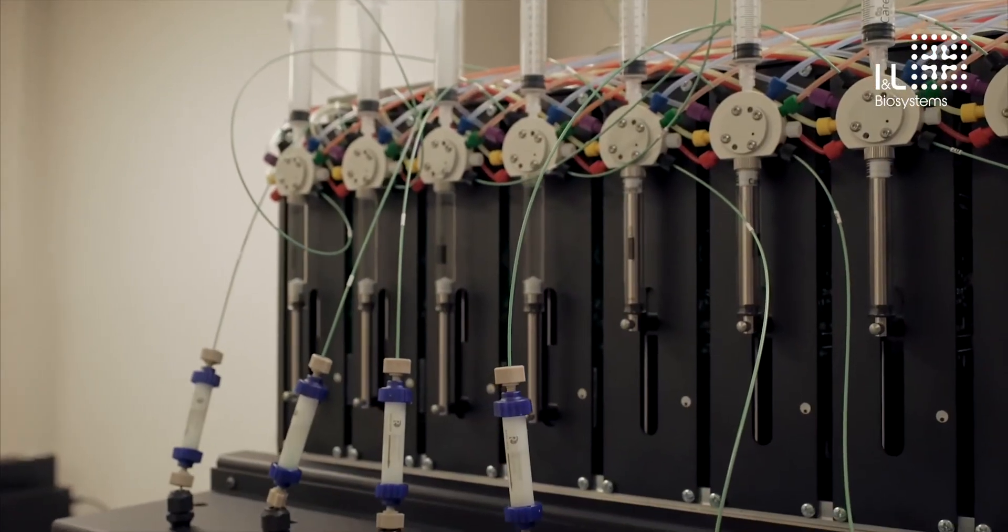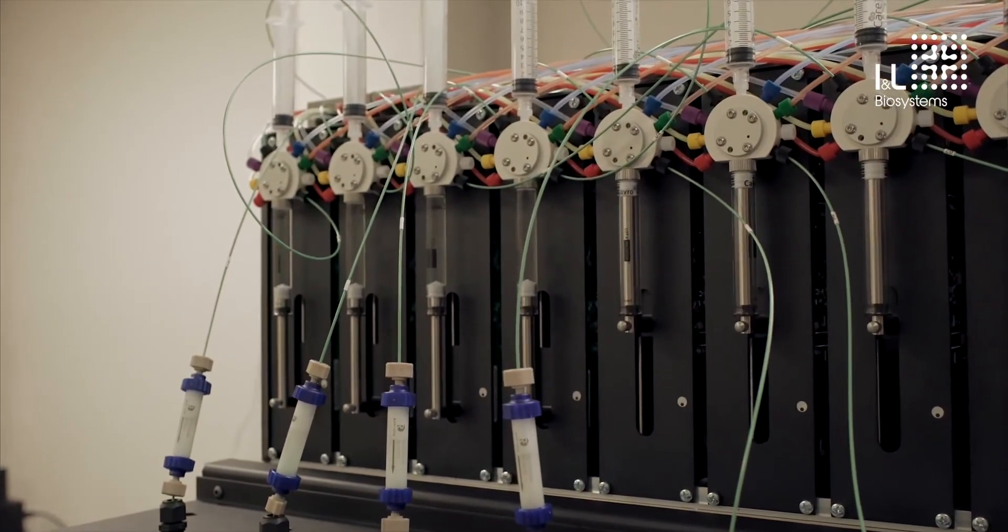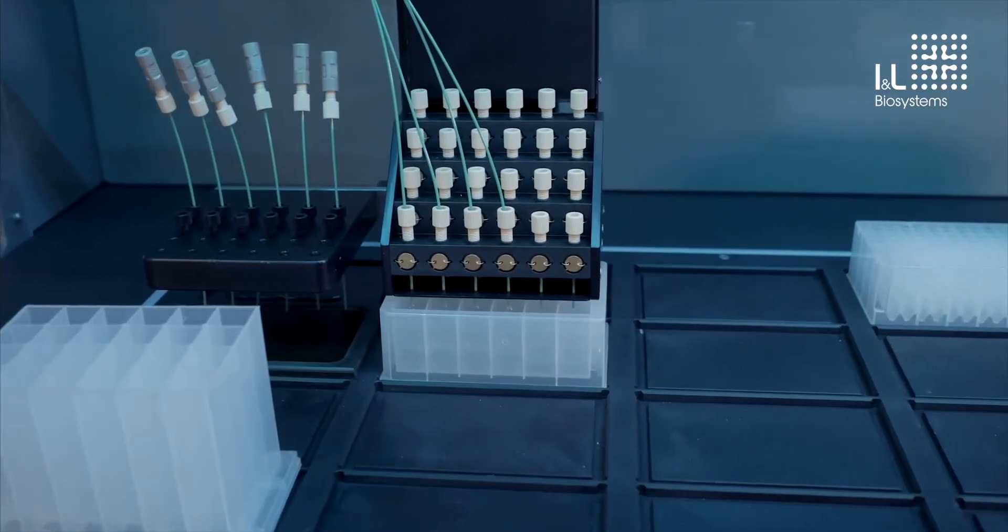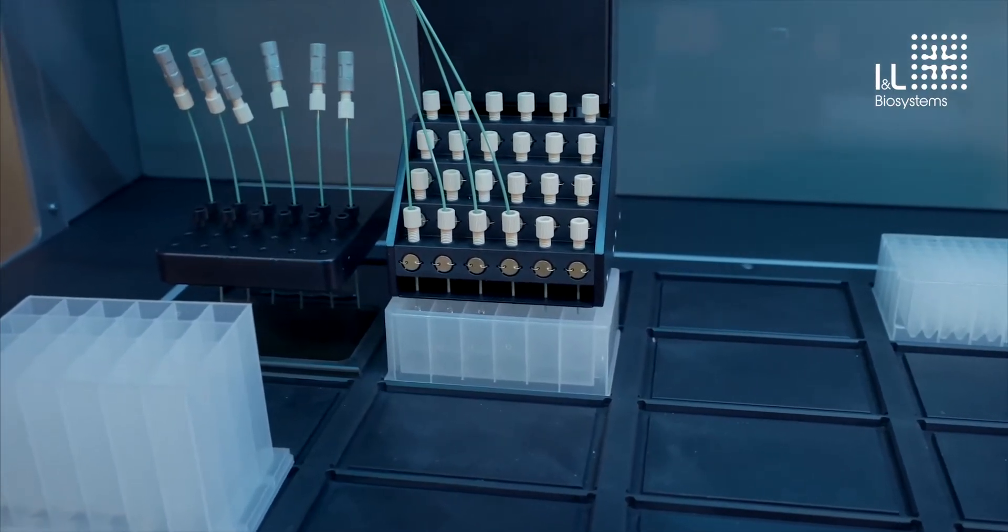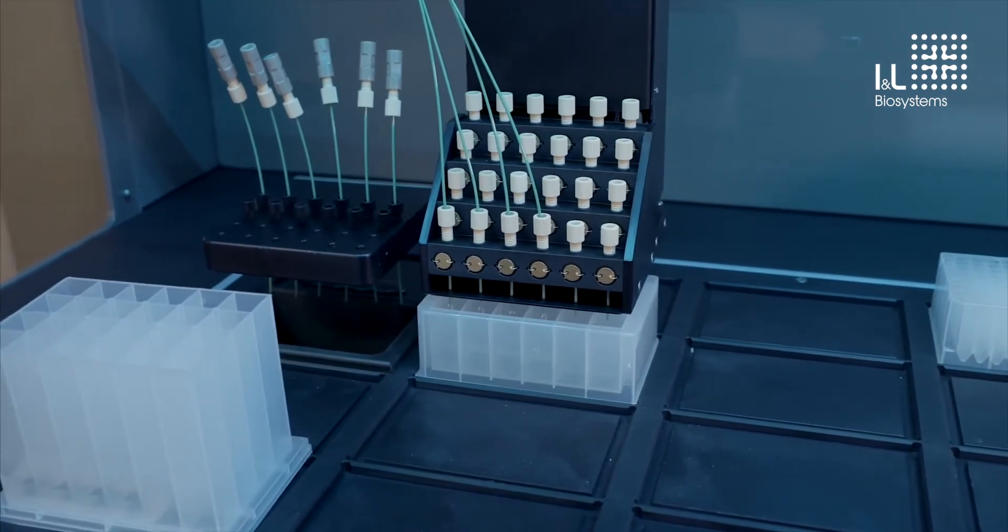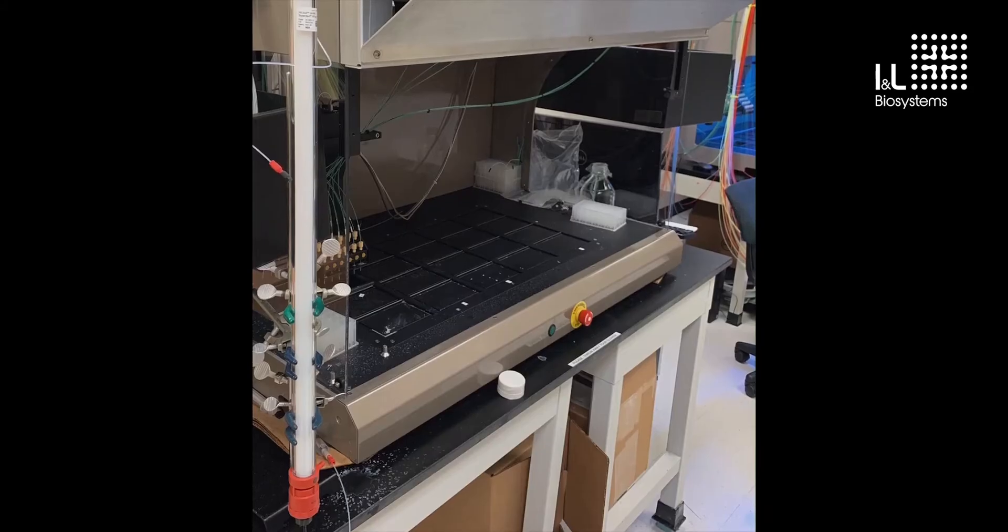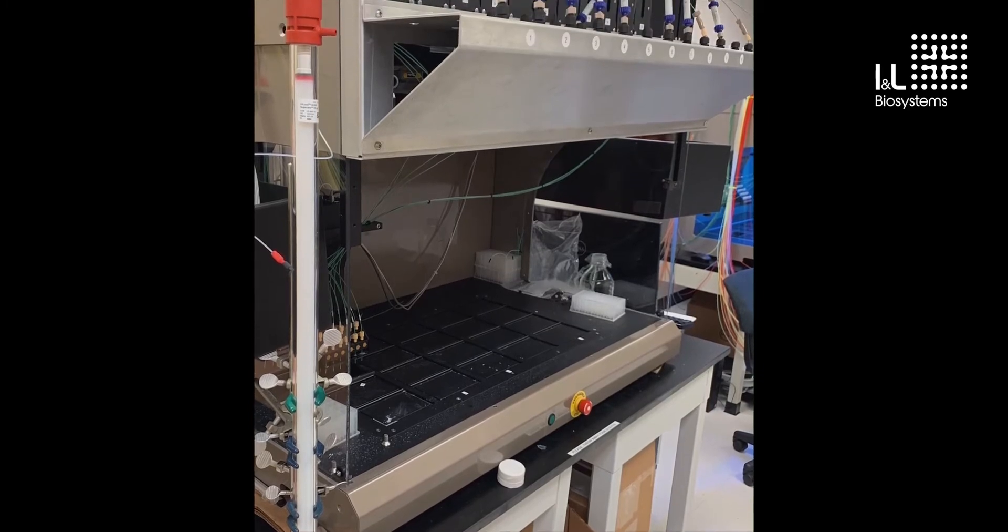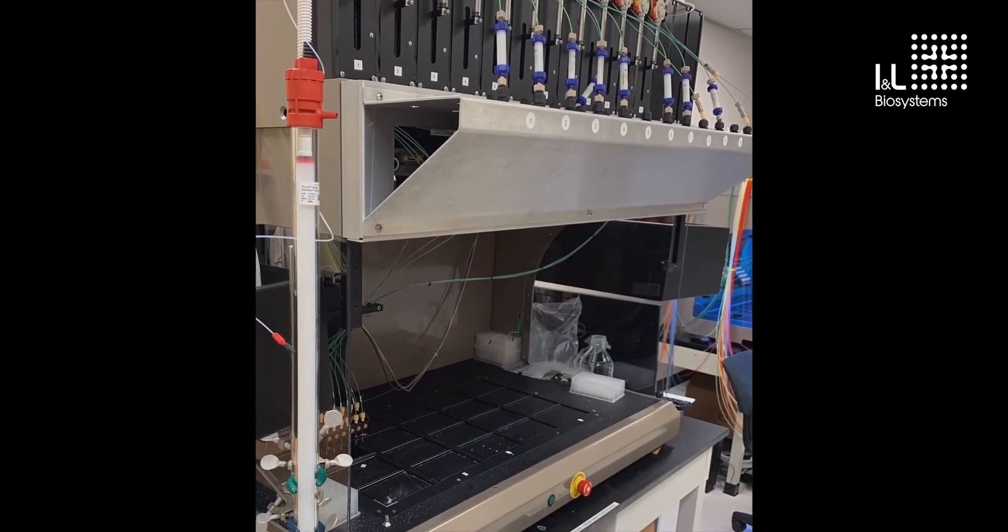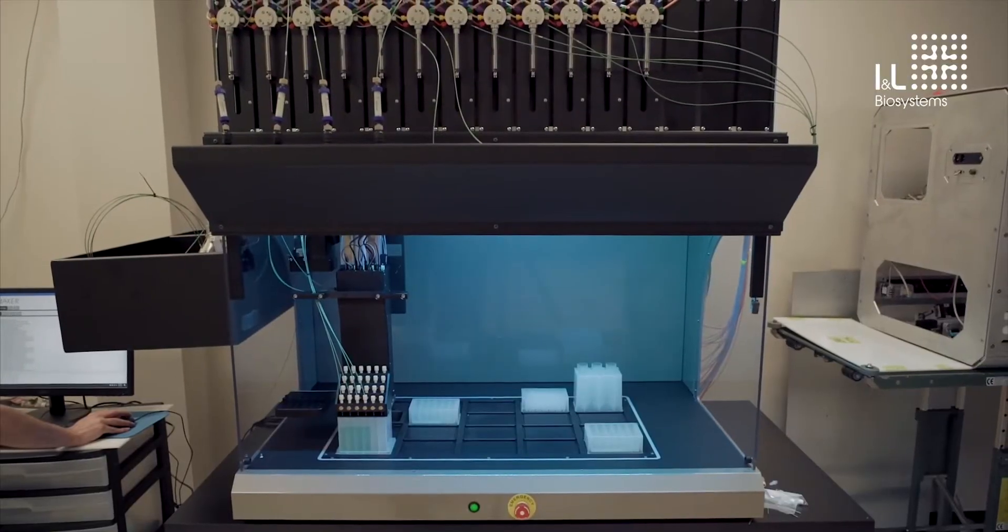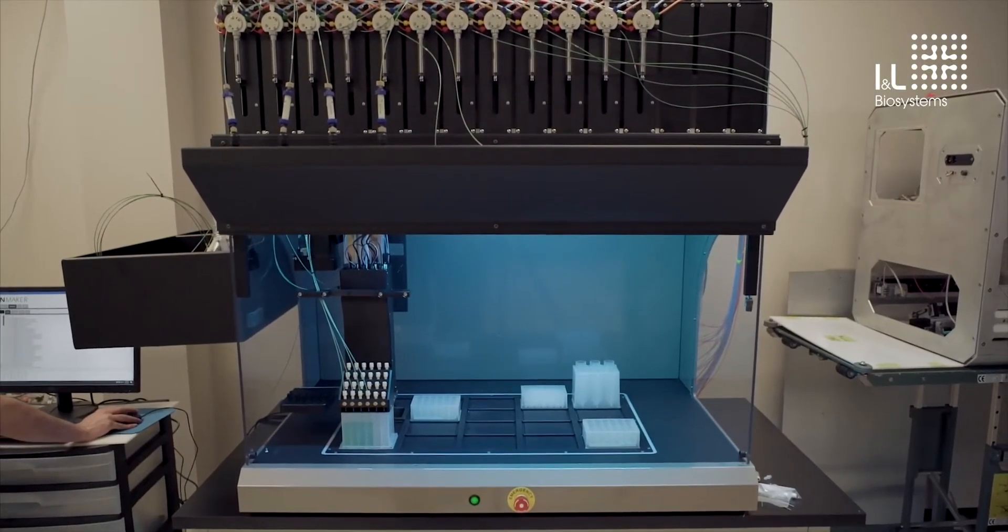Columns can be attached to the system in different places, including on this optional front shelf. Columns are often attached nearer to the fraction collection deck on the robotic arm, but columns can be secured anywhere the user desires. Here's an example of a 110 milliliter size exclusion column that we used with the Protein Maker secured beside the instrument. Our goal is to enable you to use the columns you desire.